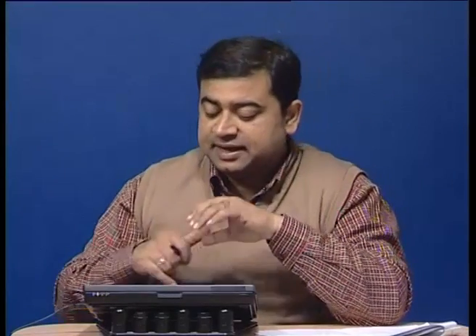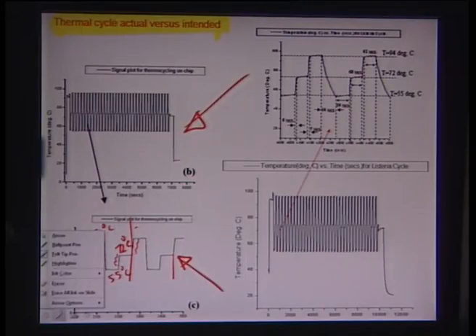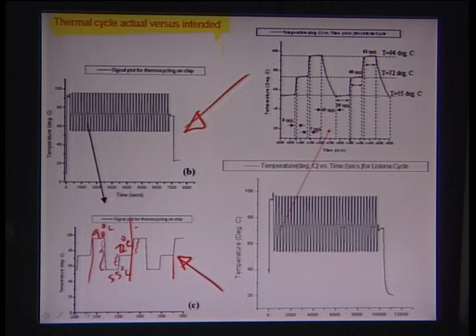This essentially shows some plots here, which are signal plots acquired by a National Instruments LabVIEW package on some real-time microchips, which our lab has developed over the past some years for different thermal cycling modalities.